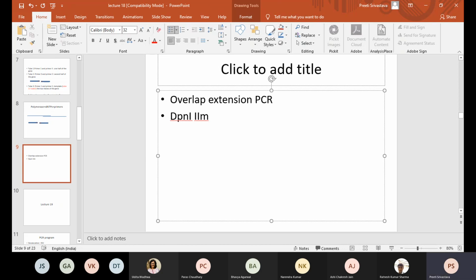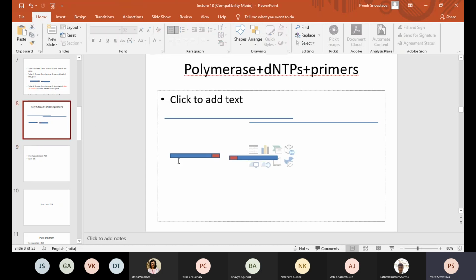This is how you are enriching the mutated fragment largely, because the non-mutated ones will be removed by the enzyme DpnI, point number 1, and these two halves cannot be amplified. Even if they self-anneal, they cannot be amplified by primer 1 and primer 2. So therefore you will have a vast majority of the population which is the desired sized fragment which contains the mutated one.